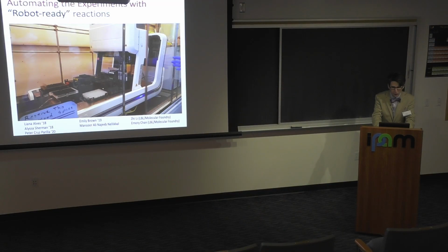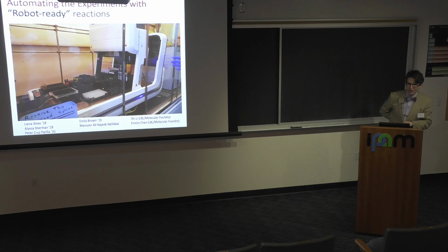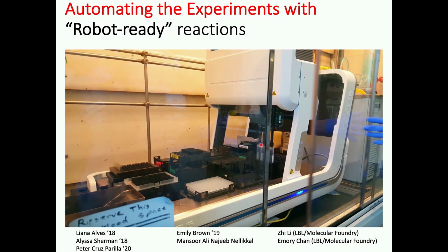Okay. So, just as motivation then, right? We wanted to automate the experiments. And again, keeping with this idea of automation but not autonomy, we were constrained in this project to just work with commercial, off-the-shelf robotic liquid handlers, right? Like the one shown here. It sounds really fancy. It's really just a fancy set of pipette tips.